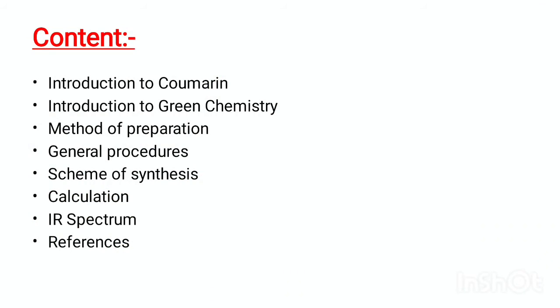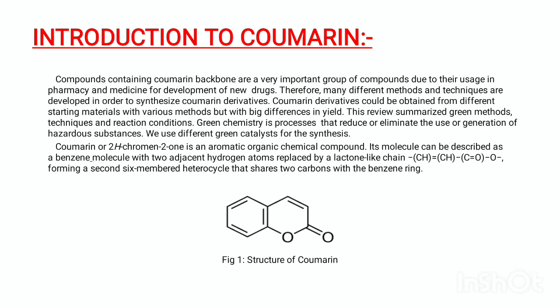Contents: Introduction to Coumarin, Introduction to Green Chemistry, Method of Preparation, General Procedures, Scheme of Synthesis, Calculation, IR spectrum and references. Introduction to Coumarin. Compounds containing the coumarin backbone are a very important group of compounds due to their usage in pharmacy and medicine for development of new drugs.